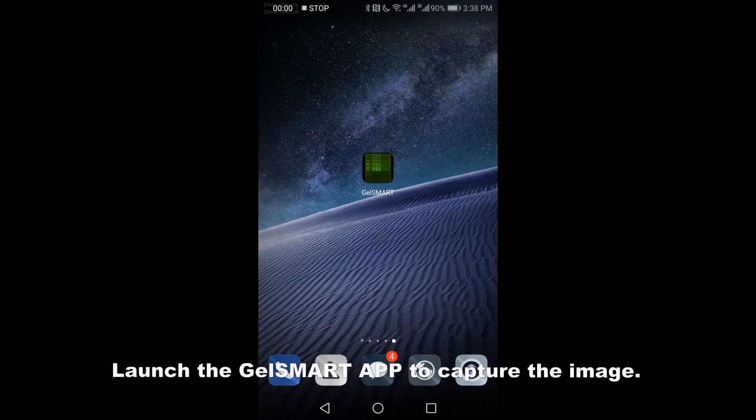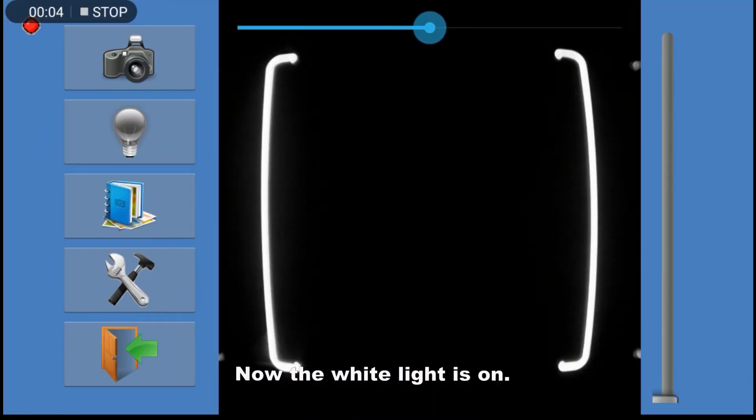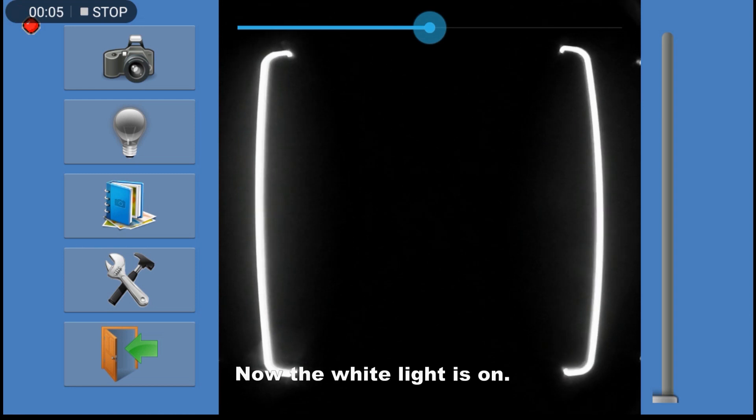Launch the Gel Smart app to capture the image. Now the white light is on.